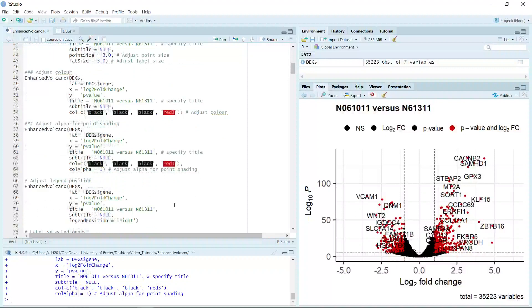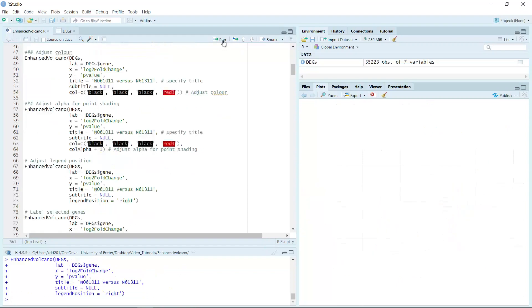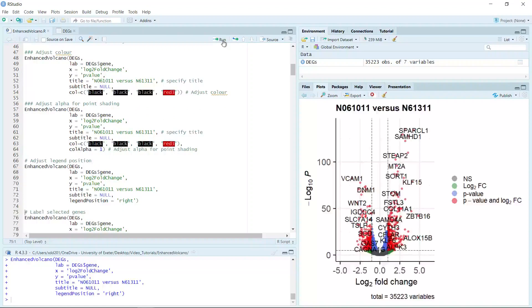In the next demonstration, we can adjust the legend position. At the moment the legend position is at the top. If we set the legend position to the right and run the code, you can see we have moved the legend to the right-hand side.